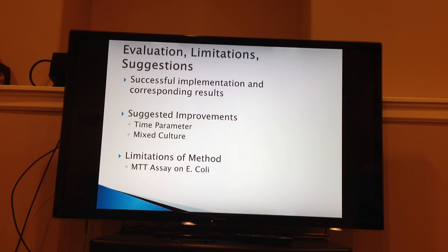And this was noted in my experiment in that there was a clear line of background, and it was very hard to differentiate the MTT readings from each other. So in that sense, the luminescence assay which I used provided clearer distinctions and better data in general.